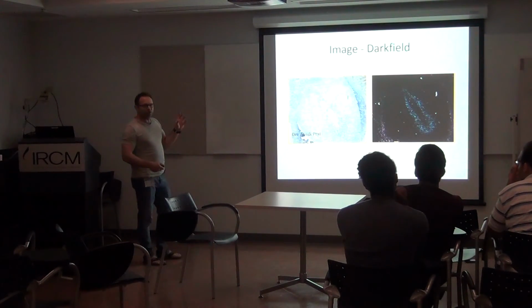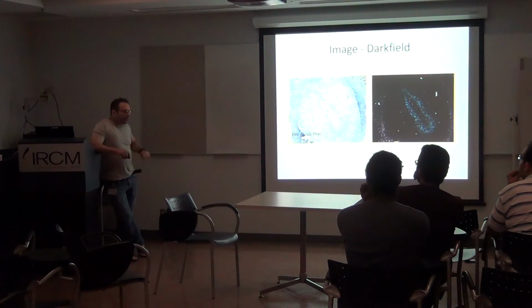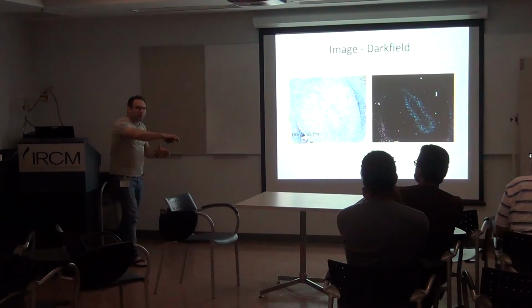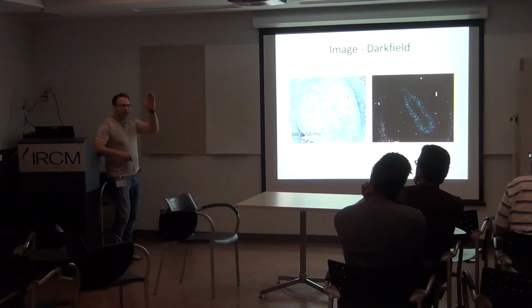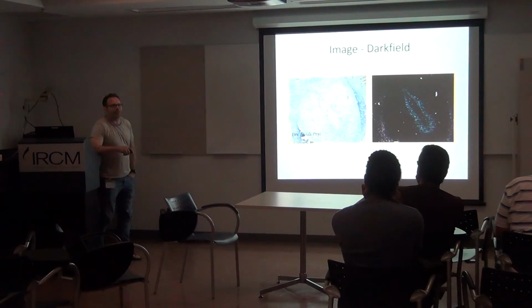So you use this kind of contrast. Dark field is really used in a really special case, I would say. But if you have really, really fine things, I've also used dark field with neurons. Sometimes you have a neuron that is really, really small, and it's hard to distinguish it from the background. And when you put it in dark field, poof, it's like a flash. Then you see only the neurons. And, yeah, so it's a nice technique also. It's used in specific cases, I would say.